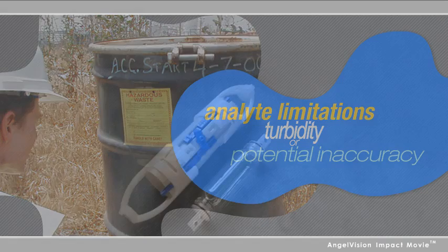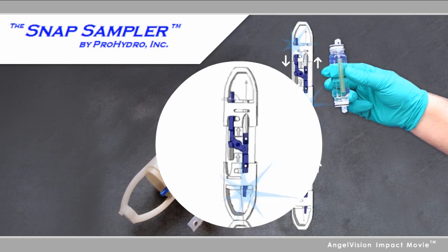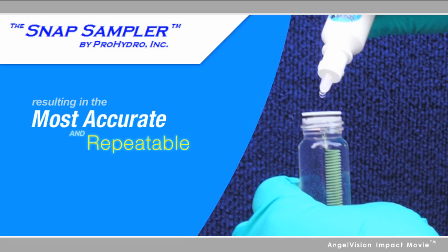The Snap Sampler uses a unique system where sample bottles are set open at both ends, and when triggered down-hole, seal groundwater samples in-situ with no headspace vapor and collect samples from the exact same depth every time, resulting in the most accurate and repeatable data possible.